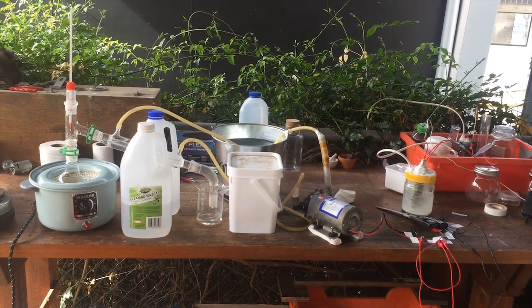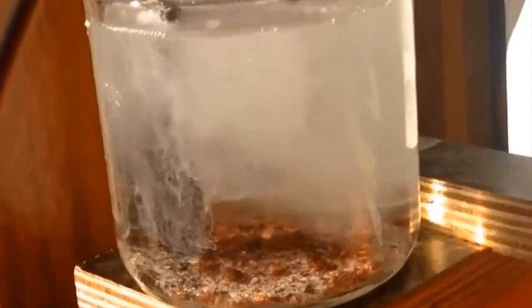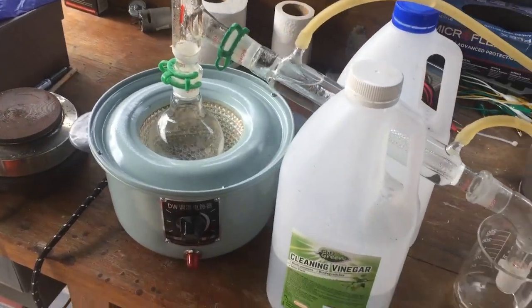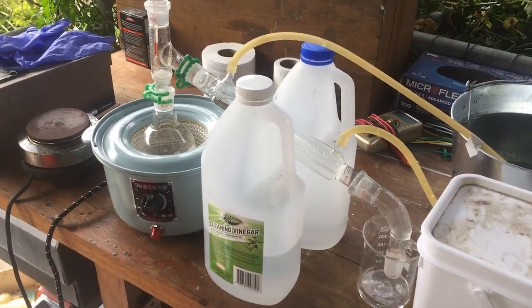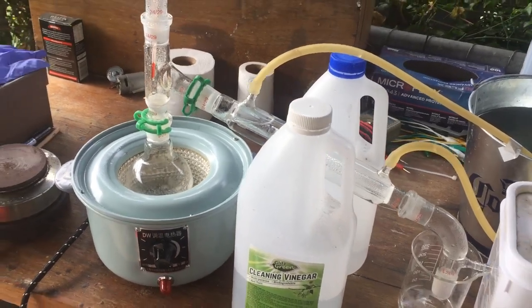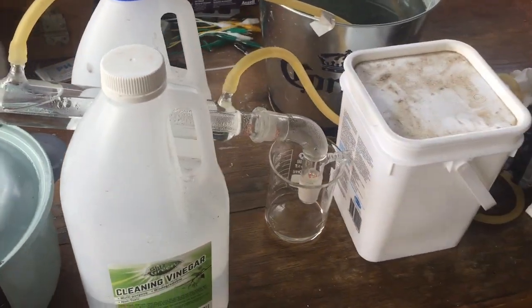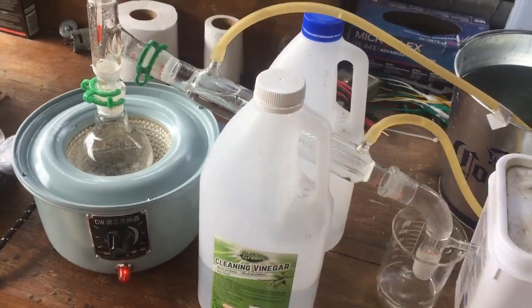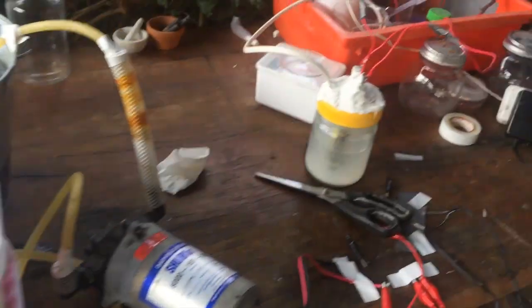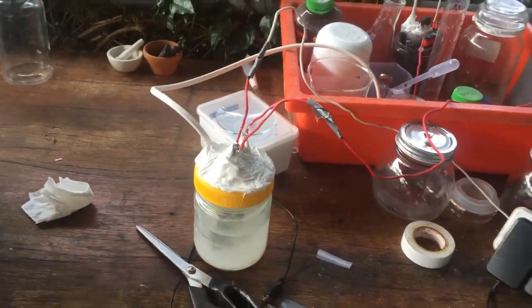Hi guys, Harry here. Welcome to Scrap Science. Heavy water — alright, what part are we up to now? I don't know, like part four or something? If you've seen the other three or so videos on the heavy water series, you'll know that what I'm doing right now is I'm distilling the heavy water, or the water that's concentrated in deuterium, to make it nice and pure so we can put it back into another electrolysis cell and continue electrolyzing down.